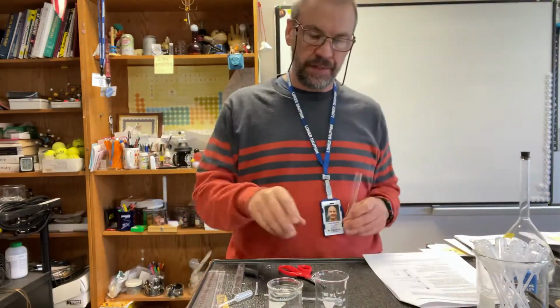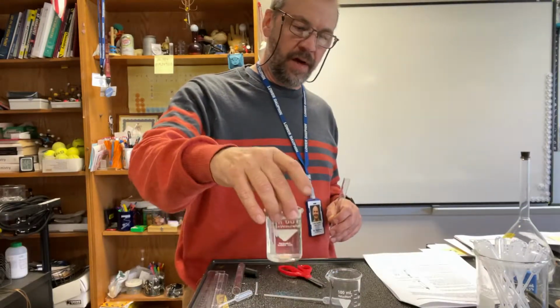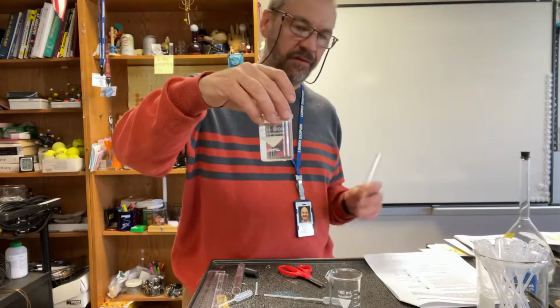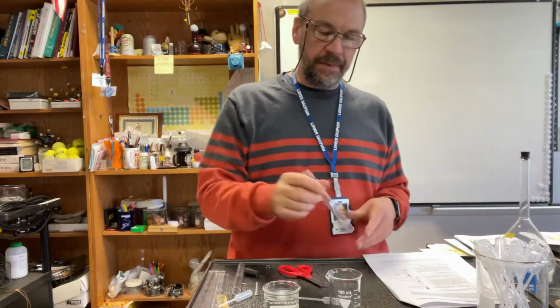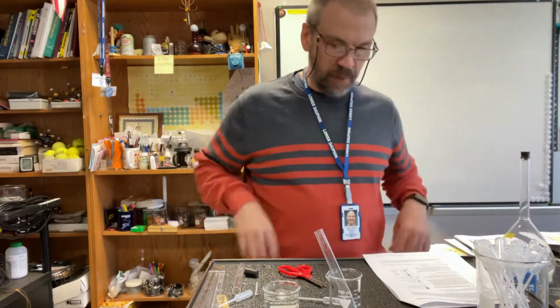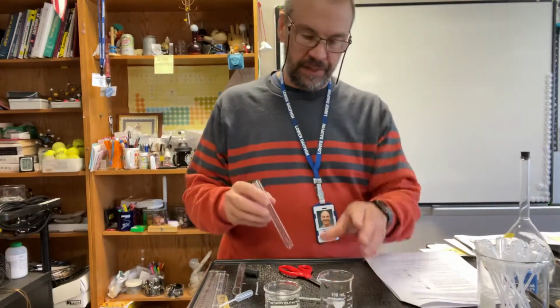Fox will have those, and you're going to get a couple small beakers. One of them you'll have to pour some hydrochloric acid. In fact, Mr. Fox might just have one at the front desk. That might be better. But then the other one is to hold your test tube upright. The lab says use a paper cup or something, but we're just going to use beakers.